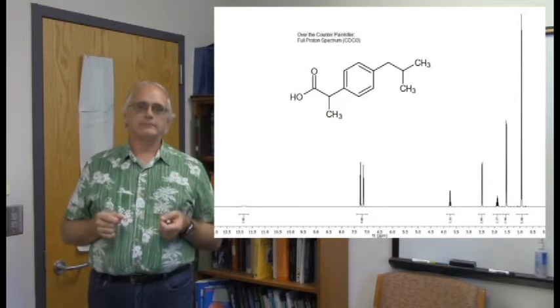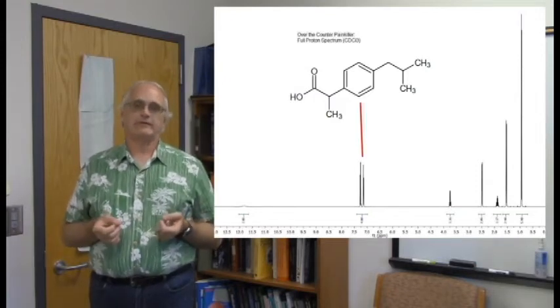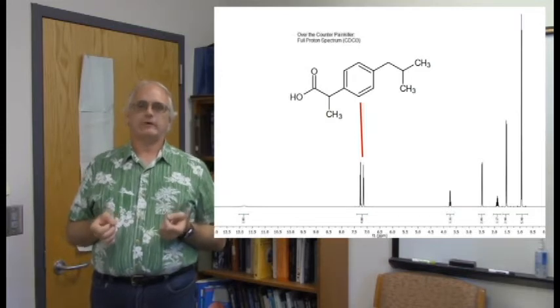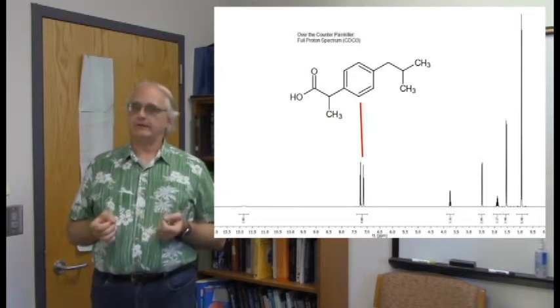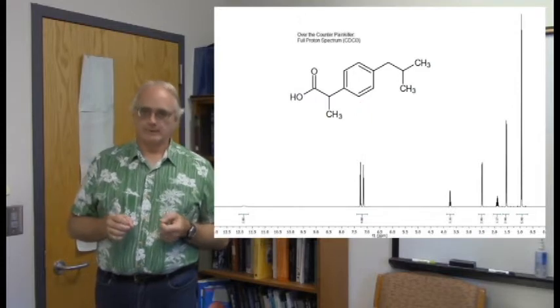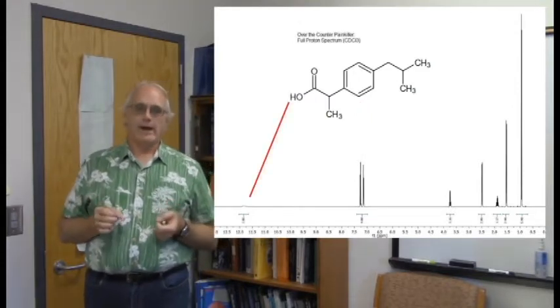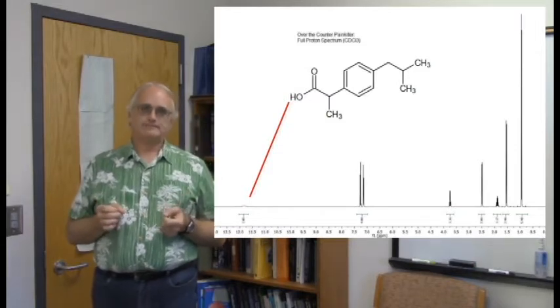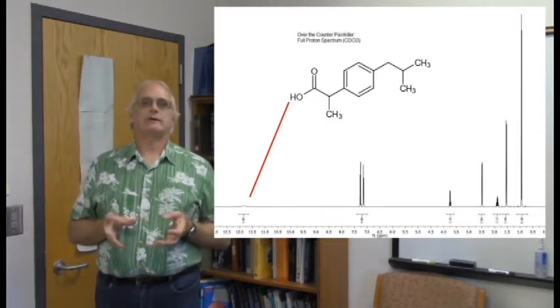You have the aromatic groups in a group between 7 and 7.5 ppm, nice pretty symmetric structure here, parasubstitution integrating to four. You even have this lovely carboxylic acid resonance way downfield here, almost at 12 ppm. It's very broad, but very distinctive as well.